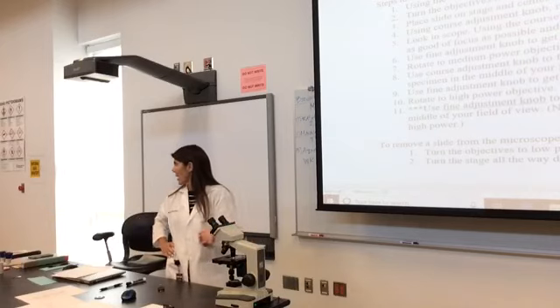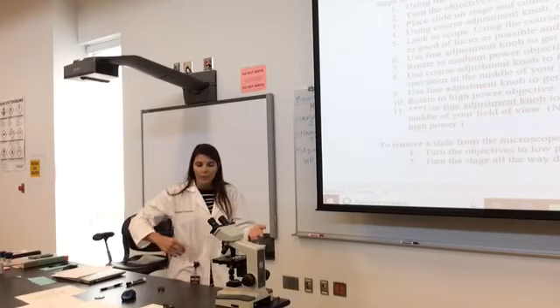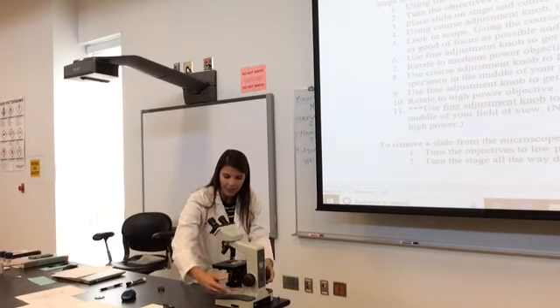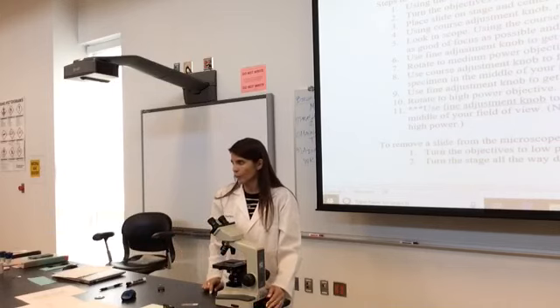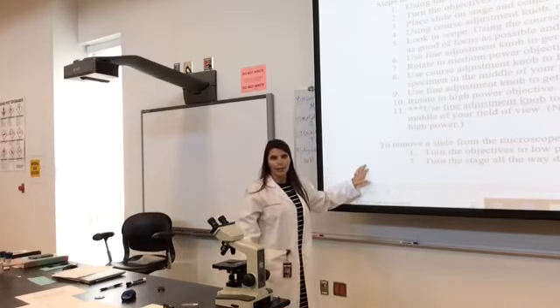And then you say, hey, I got it. And I say, okay. Then I come and check it. And I'm like, okay, yeah, you got it. Great job. Now what? Then when you're finished, you have to drop your stage all the way down, go to the low power engaged, microscope slide off, turn off your microscope. All of these steps are outlined here. I'm going to do this a little quicker now.